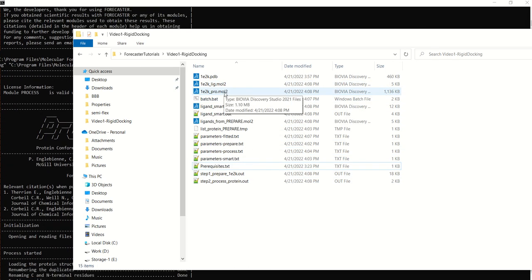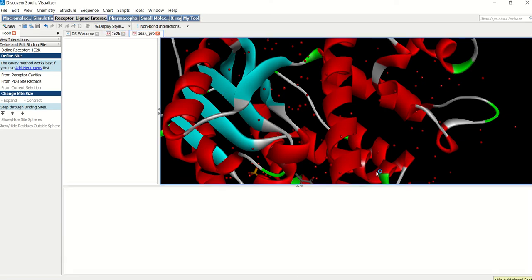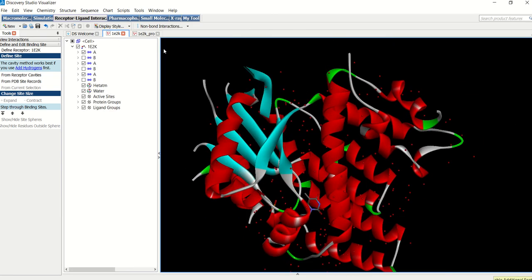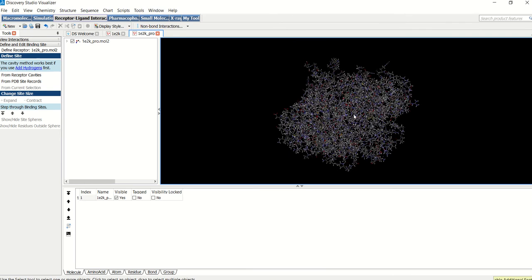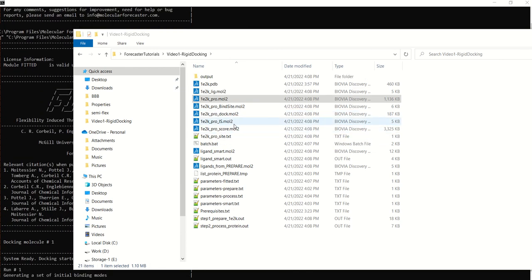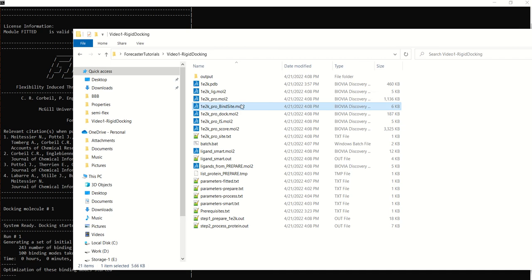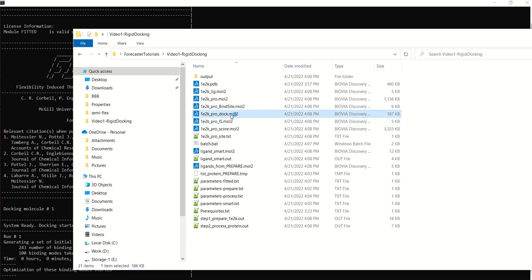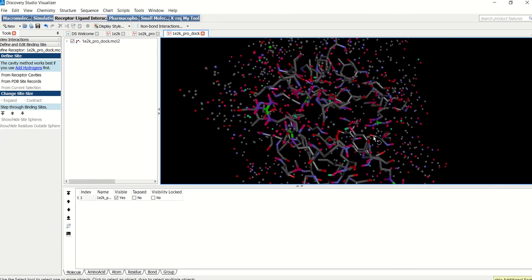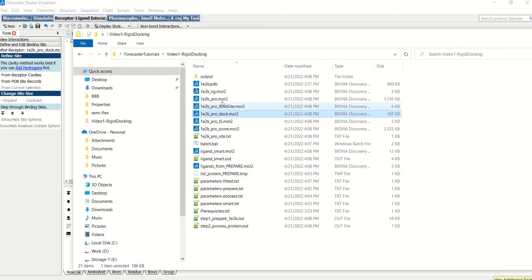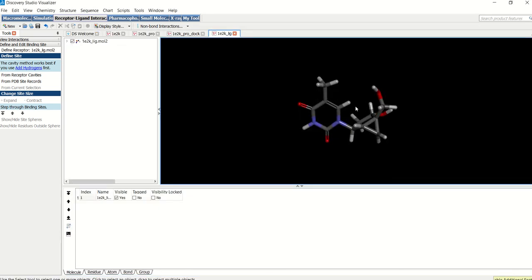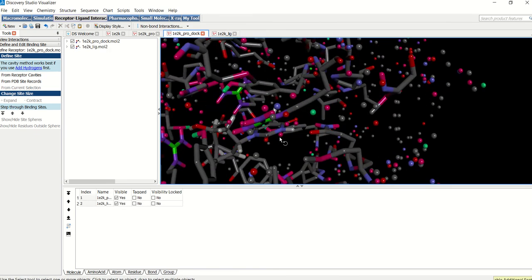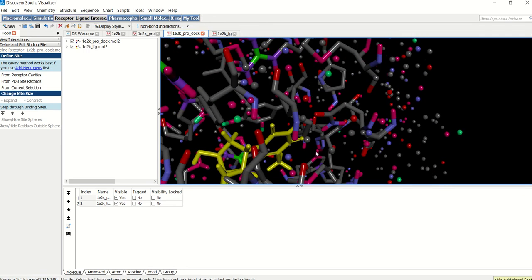So this is a mol2 file. With hydrogens added to a protein structure. So you will see here. It's very different from the original. Which is just heavy atoms. And from this particular structure. Fitted will auto select the binding site. Based on the ligand that we've just extracted. So once this is done. You will see there's a bind site file created here. There's an interaction site file created here. And then there's a prodock file created here. This is the actual file that fitted uses for docking. So this is the binding site. And now if we are to just take the ligand. That was created. That was taken out of the PDB structure. And then just copy it in this prodock. You will see that. This is the conformation within the PDB.